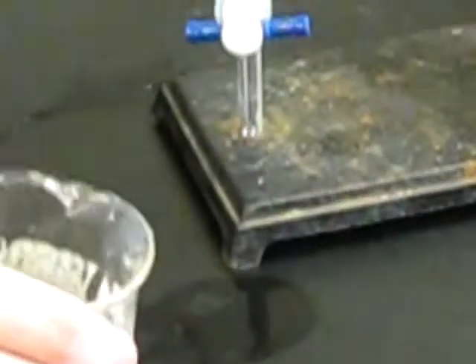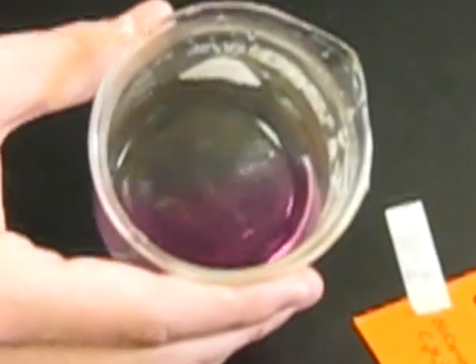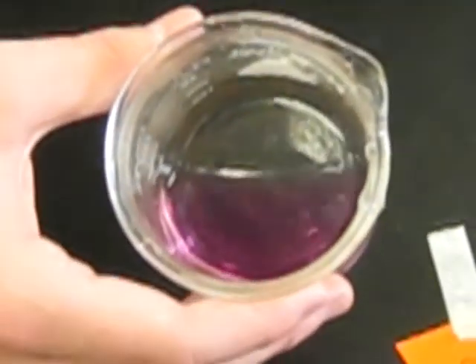This process can take a little while. You want to be careful that you don't add too much base. That way we get an accurate reading at the end. There's like a drop right there. Okay, so the color started to hang around. It looks like we got about the color that we needed right at the start there.